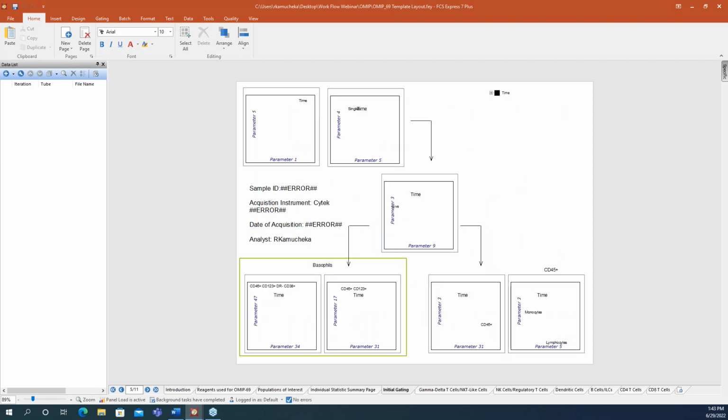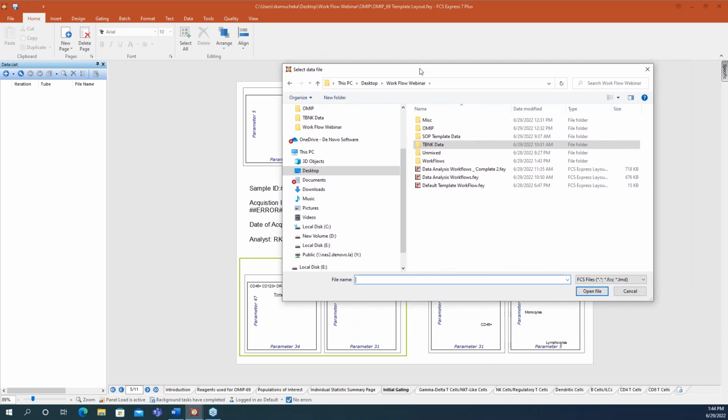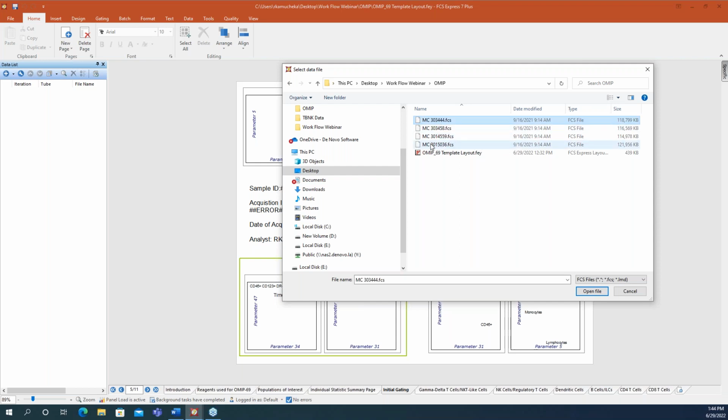You see all these empty plots and maybe some errors here. And all this is just a reminder that you need to add some data. And once I add the data, I'll be able to pick up wherever I left off. I won't have to go back and recreate anything. I'll just be able to keep moving on. So this is like if I did day 2 of my experiment. I've created the analysis workspace. Now I'm just bringing in new data files.